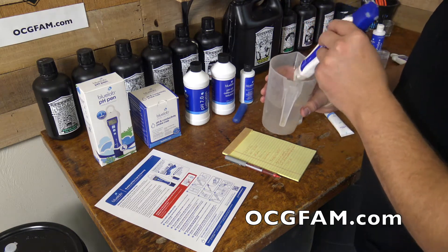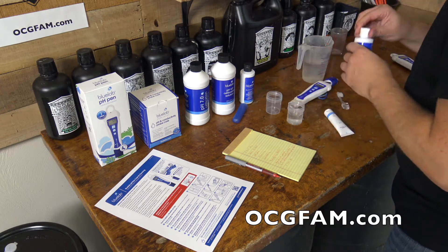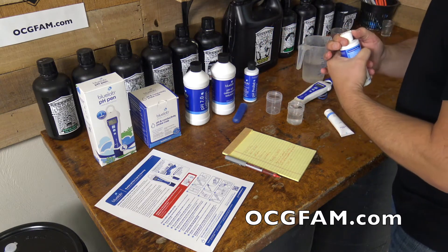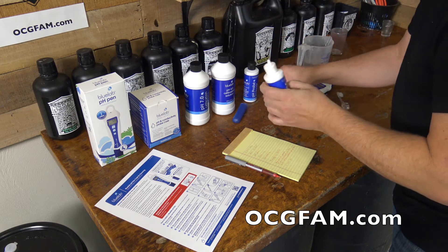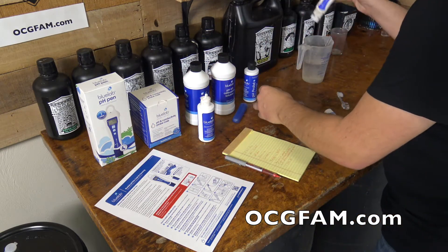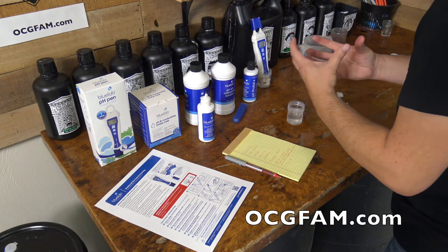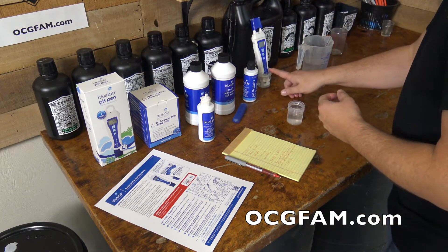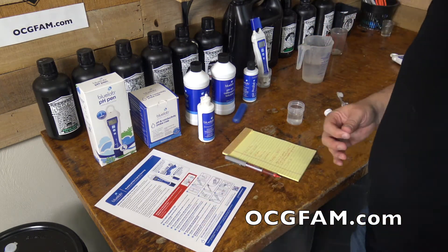The next step, very important, is to soak this for 24 hours in the KCL solution — the KCL storage solution right here. The reason is that this solution gives the probe a coating that helps it conduct electricity to work as a pH meter. You have to rinse it off really well and get it in there for 24 hours so it can build that film up again. Anytime you clean this, or the first time you get the meter, it's very important to soak it for 24 hours. Larry said you might get away with a little less, but let's stick to the instructions — better safe than sorry.